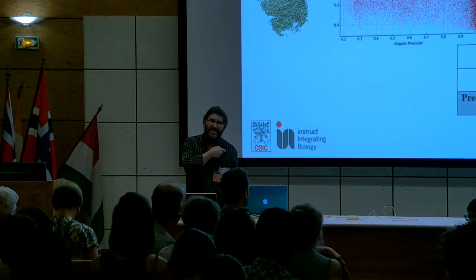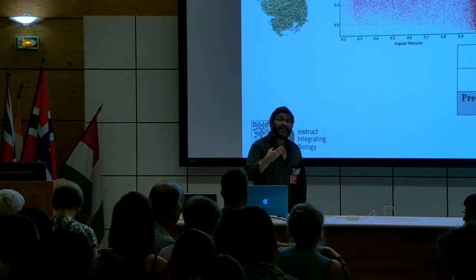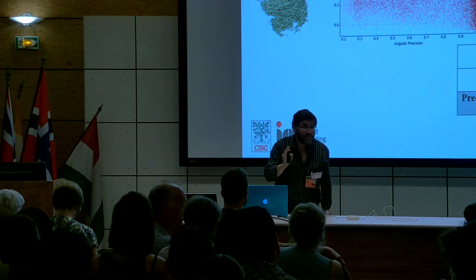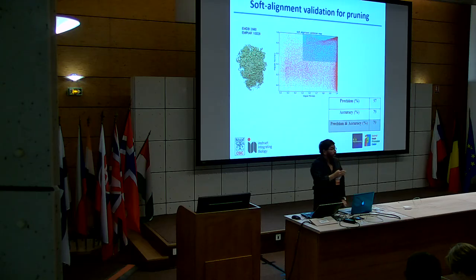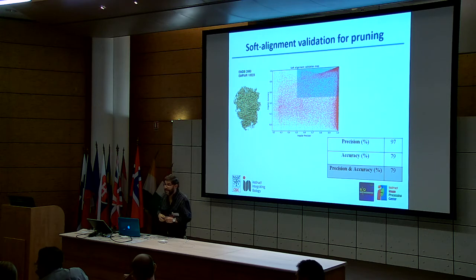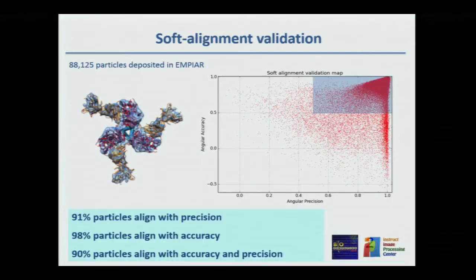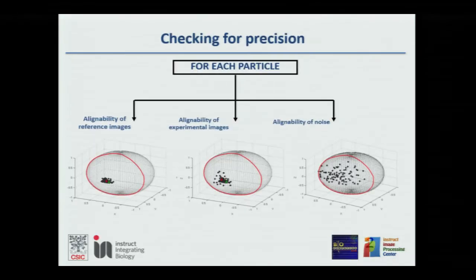Should I have had these tools, this structure would have had a validity report, and in the validity report, for whatever reason, and I agree with you that the picking was probably incorrect in this case, the validity report would already be telling you something is wrong. But it's definitely wrong, not just because of a local minimum, which is quite close to the major one. What this structure is violating is exactly what I have said, that they should converge to a certain functional.